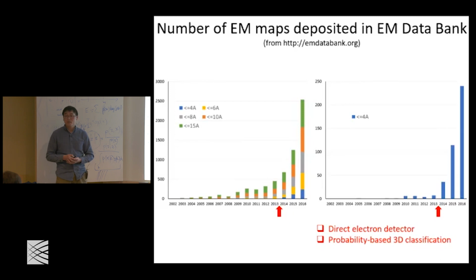I have a question. Yes. So for the membrane proteins, do we have to remove lipids? You mean completely remove the lipid? No, I don't think so. You would probably even prefer to see what's actually stably bound on the protein.